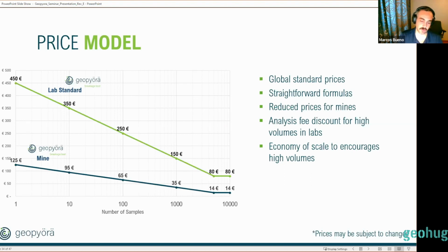And then coming back to the whole purpose of this talk, which is to say why we need to test the drill core samples. Simply because in the early stages you are doing assaying, so you already have that sample, which today is simply crushed.